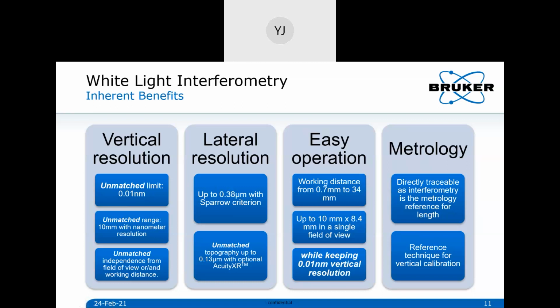If you are measuring roughness and you want to use a common ISO filter, then it doesn't really matter, because these filters are of much larger wavelength, and even our standard 5x, 10x objective is fine. But if you have very fine line widths, like a MEMS structure, or very closely patterned surfaces or structures, then you might need to choose an objective which gives you a higher lateral resolution than the structure gap that you are trying to resolve. That's how you choose the objective. It depends on the sample.